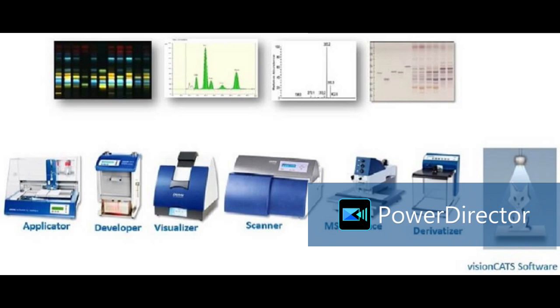So we'll also go for robotic HPTLC. Yes, this is the machine, very good. This is the complete HPTLC system which is handled robotically.